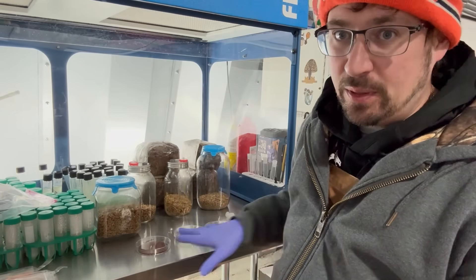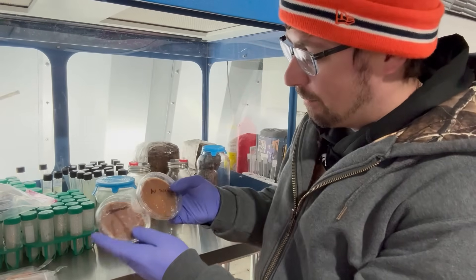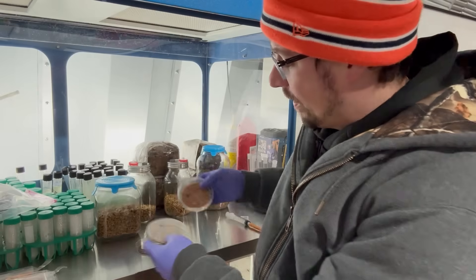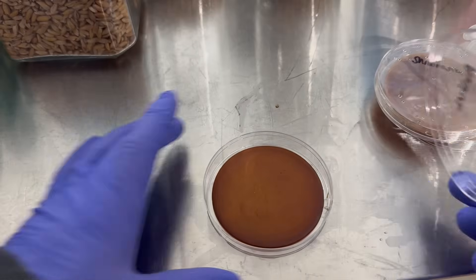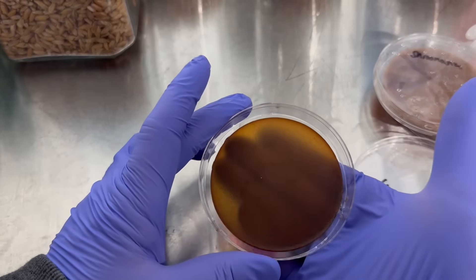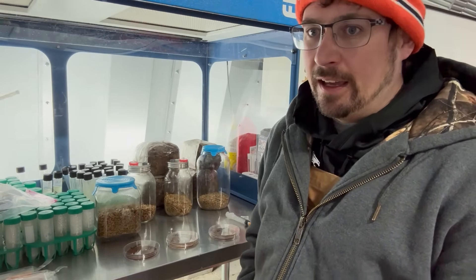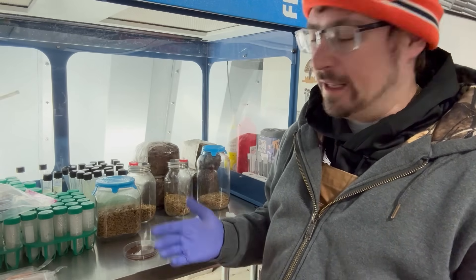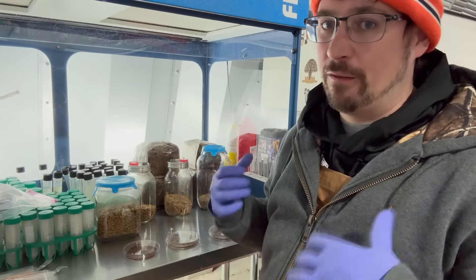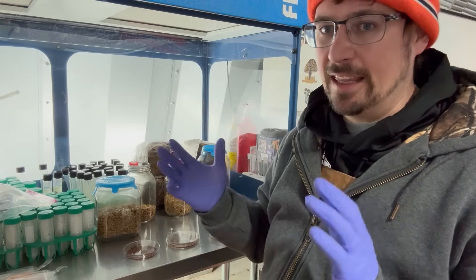Final update: I let these plates go for a little over two weeks. The Shrew Magic plate and the air signs plate are both blank — they did not grow anything. The ambient one ended up growing one colony. There's one single yeast colony, basically right there, and that validates that this Shrew Magic is pumping out clean air. If you want to try this experiment yourself, you can leave the plate open for six minutes and multiply by ten, or twenty minutes and multiply by three, or a full hour — anything under 10 CFUs is ideal, and 0 is ideal.